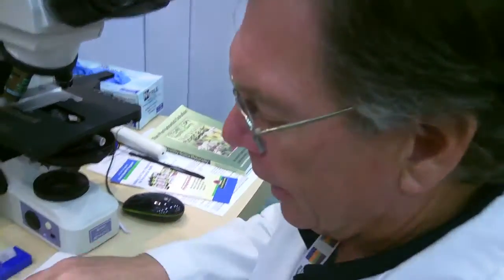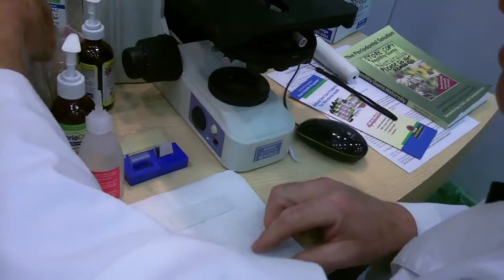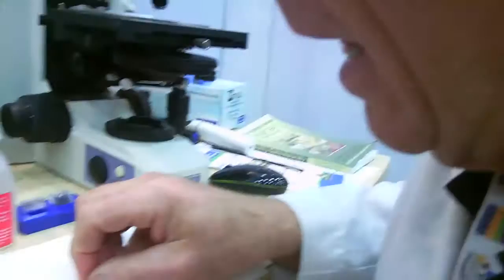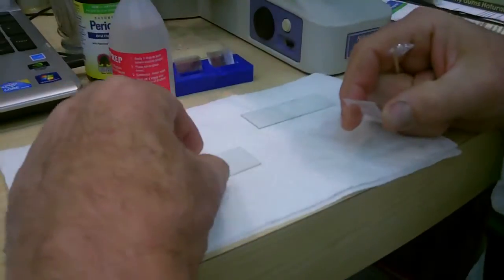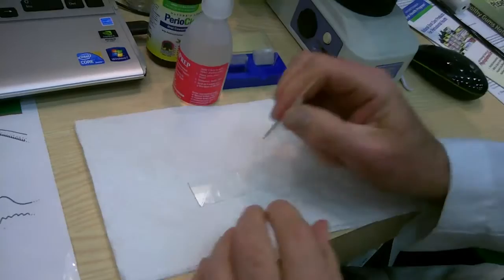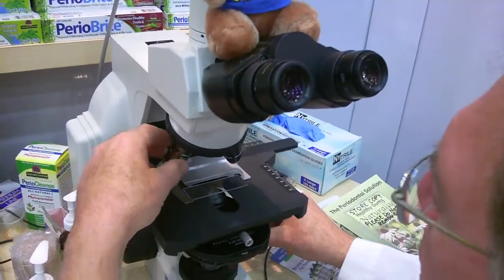I'm more than perfectly willing to do this. I irrigate and do a program that I have created every single day, and it works. I'll take a toothpick, go in here, and get a good sample like that. Then I'll roll it out onto the slide, take a cover slip and place it on here just like we did. We'll put this up on the slide here and take a look at what we have.